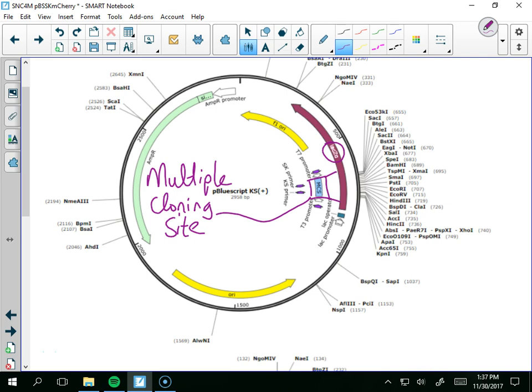But if I shove another big gene in there, can I still stain blue or no? So we're actually looking for a loss of that trait. So if my bacteria are staining blue, they don't glow, but they stain blue, right? Then I know that it's just pBluescript plasmid that went in. But if they don't stain blue, and they're still there, I know that they have made it through, and they probably carry my insert. They probably do, but I don't know for sure. They might, okay? So I would grow a plate of bacteria, a bunch of them would stain blue, and a bunch won't.